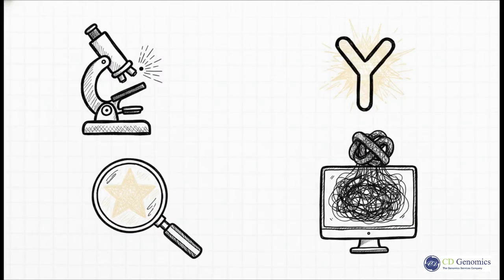Now, like any advanced laboratory tool, this methodology has a very specific profile. Its strengths are absolutely profound. It gives you high-throughput analysis, incredible sensitivity for low-abundance modifications, and exact spatial resolution. But you have to be precise. The catch is that it absolutely requires exceptionally high-quality antibodies to work properly, and it heavily relies on highly specialized bioinformatics to untangle the incredibly complex data it spits out.